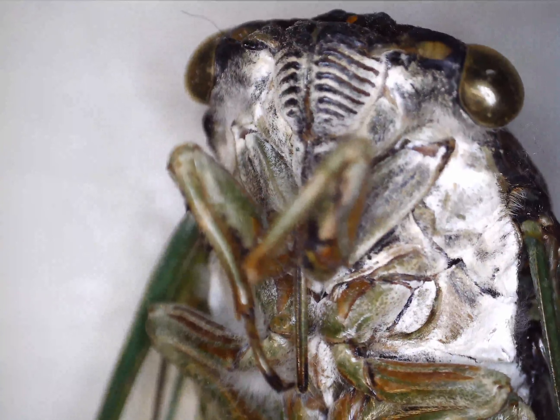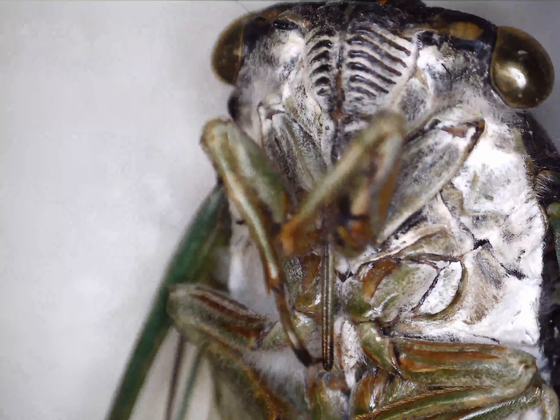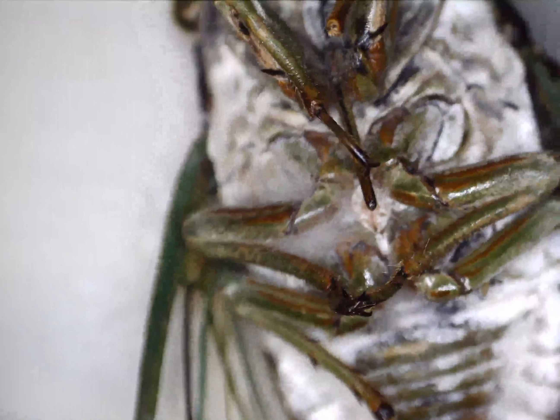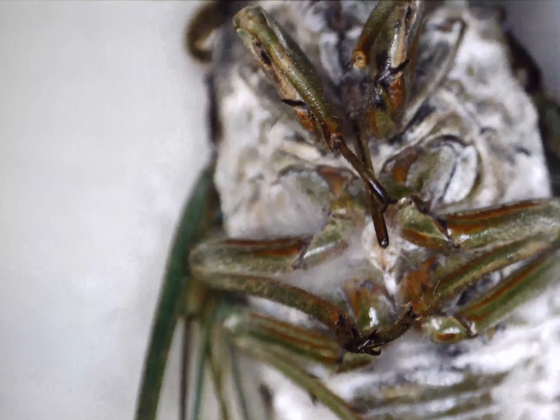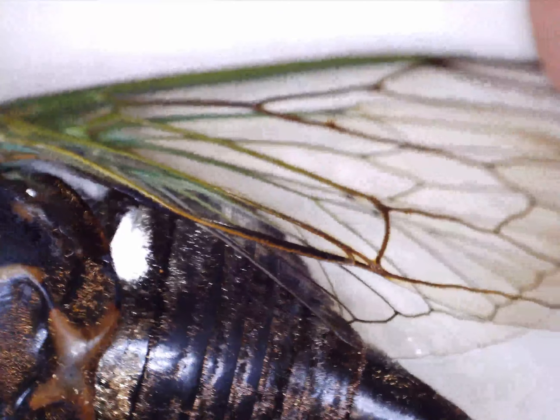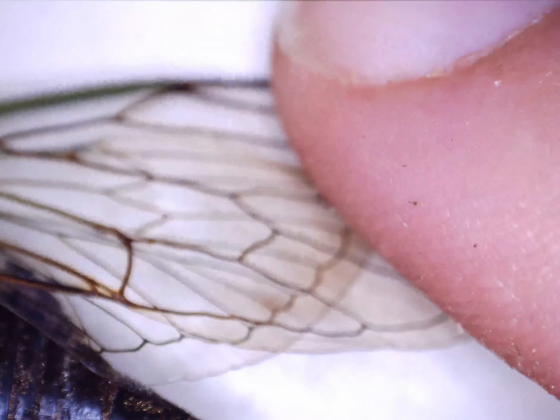What's up YouTube, this is part two of my cicada video. In the last video we had the pupa that it molted from, and this is what it looks like after it's molted. These are the noisemakers — these are the ones you hear all night and day and they don't shut up at all.